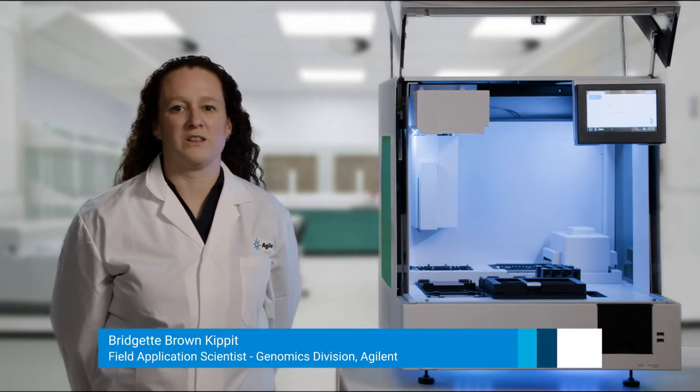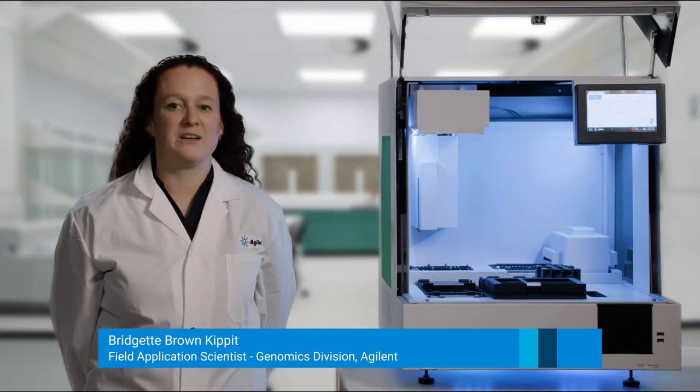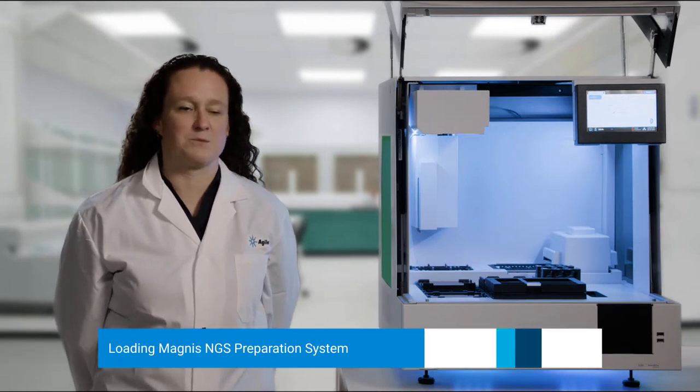Hi, I'm Bridget Brown-Kippitt, one of the field application scientists with the genomics division at Agilent. I'm here today to describe how you load the deck of the Magnis NGS prep system.